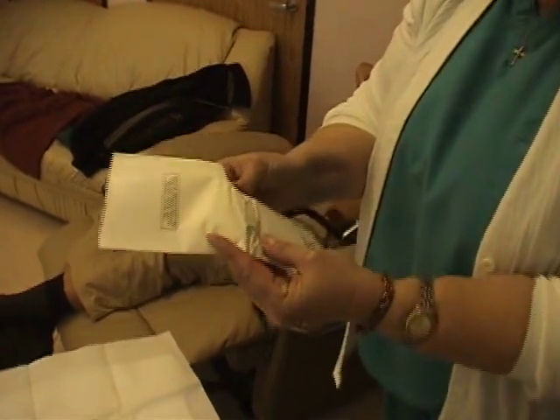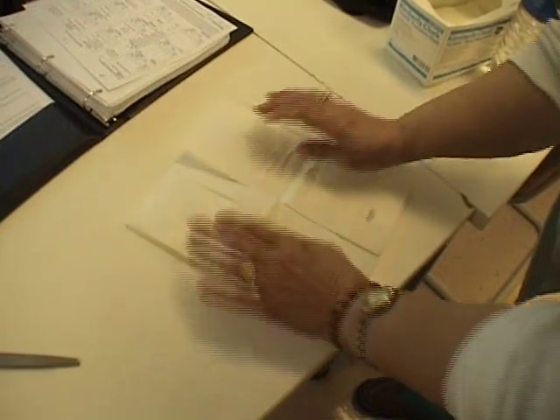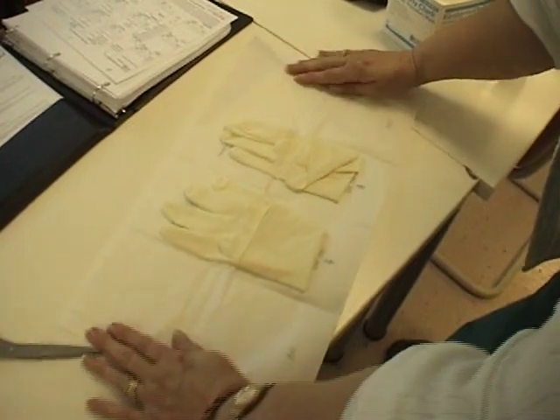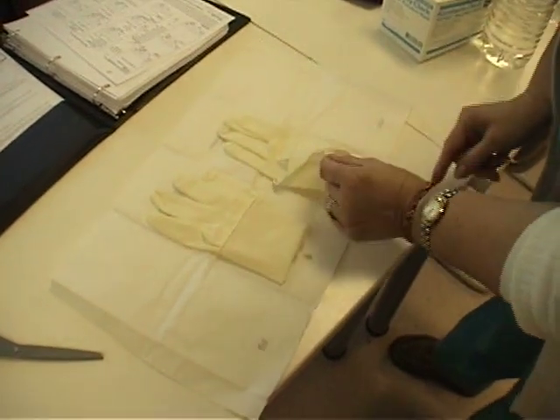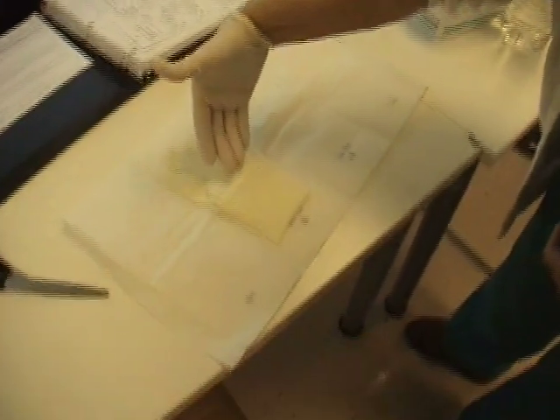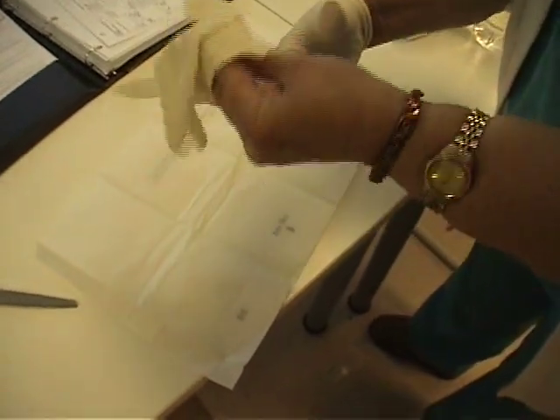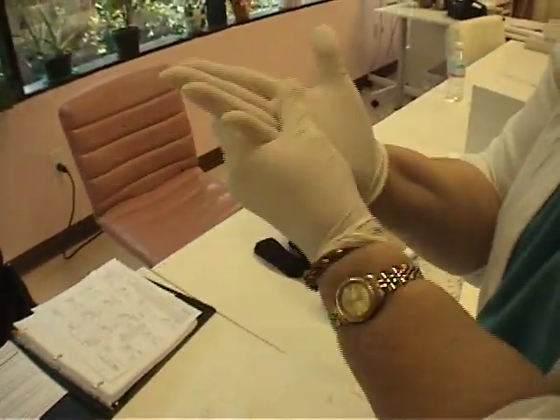And we're going to go over to the table so I can open this up and show you how it is opened. We're going to lay this down on the table. And you see a left and a right. Open the sides up without touching the inside. Just press down the end so it doesn't fly back up and hit you. Pick the glove up by the cuff. Put your fingers in as best that you can get. They don't always go in the right slots, but then you're going to take this hand and go under the cuff because you don't want to touch the powdery stuff. Put your fingers in again and get them on. Now you can adjust if they need to be adjusted.